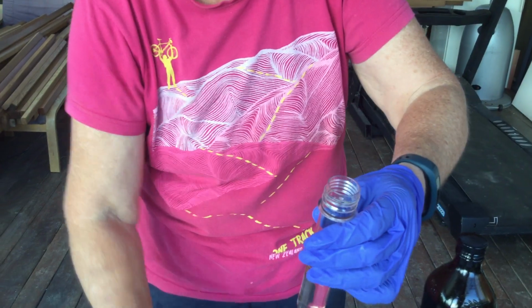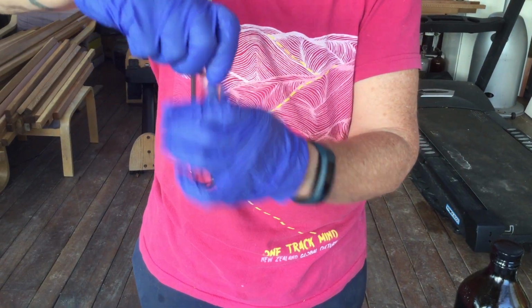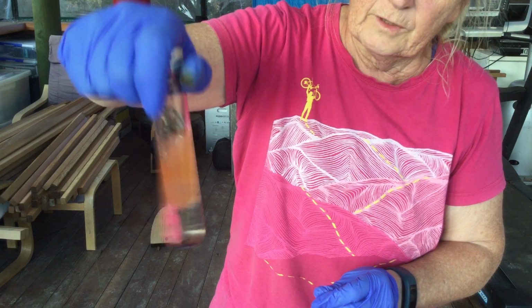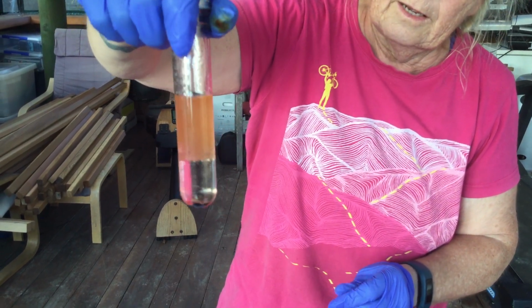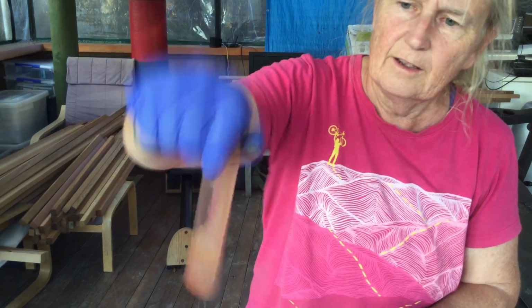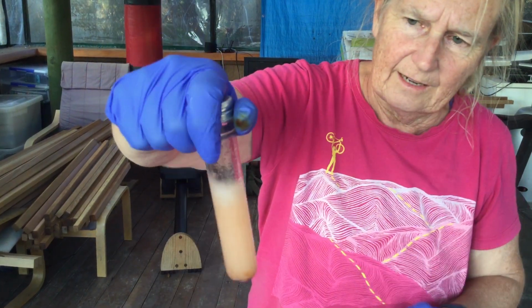And you might think again, well, why do we care? We care a lot because different cells in our body and different constituents of our body are soluble in different things, and different solutes are soluble in them. And it all depends on how much of a share of those electrons it gets. And I think you can see, if I shake this up, it will take a while to settle out.